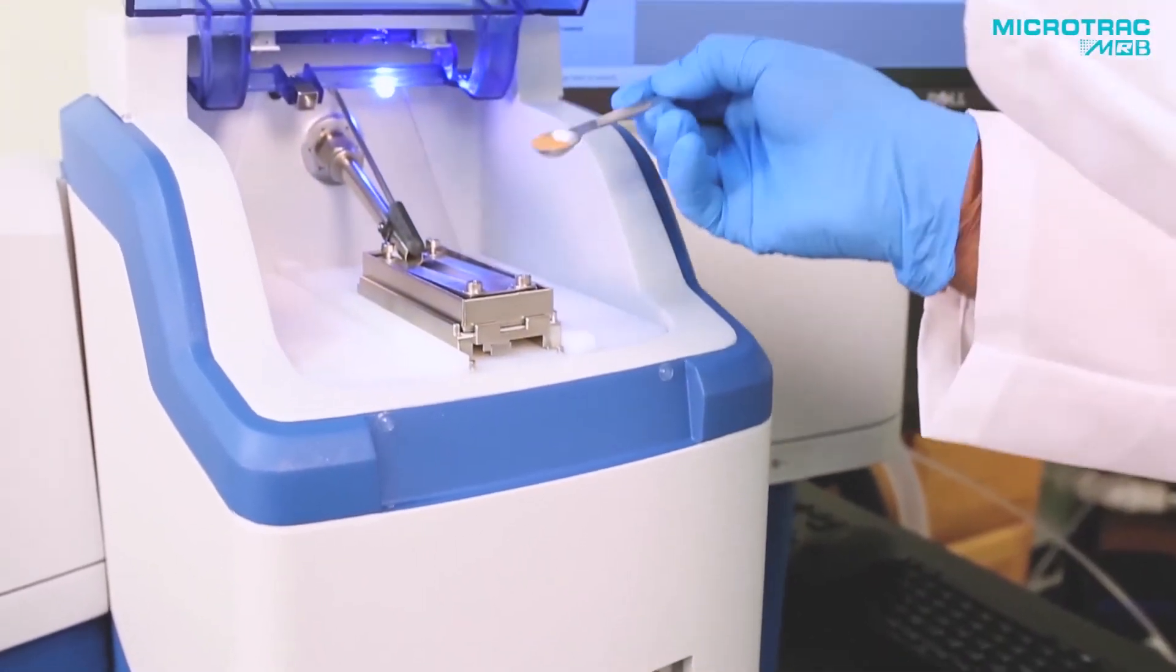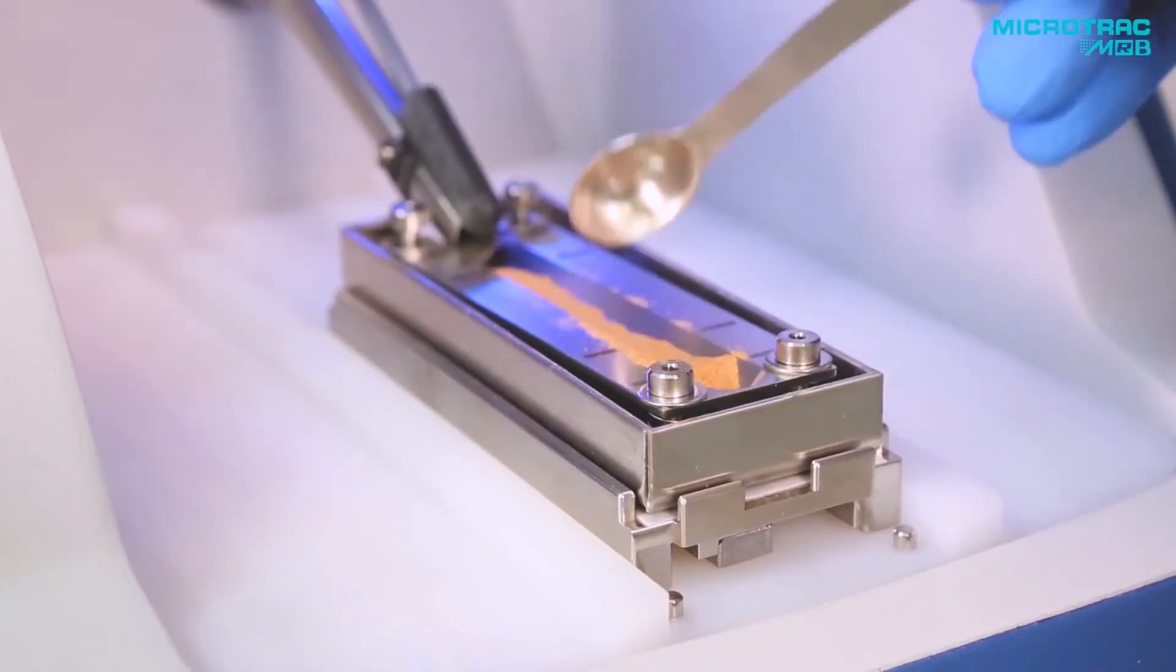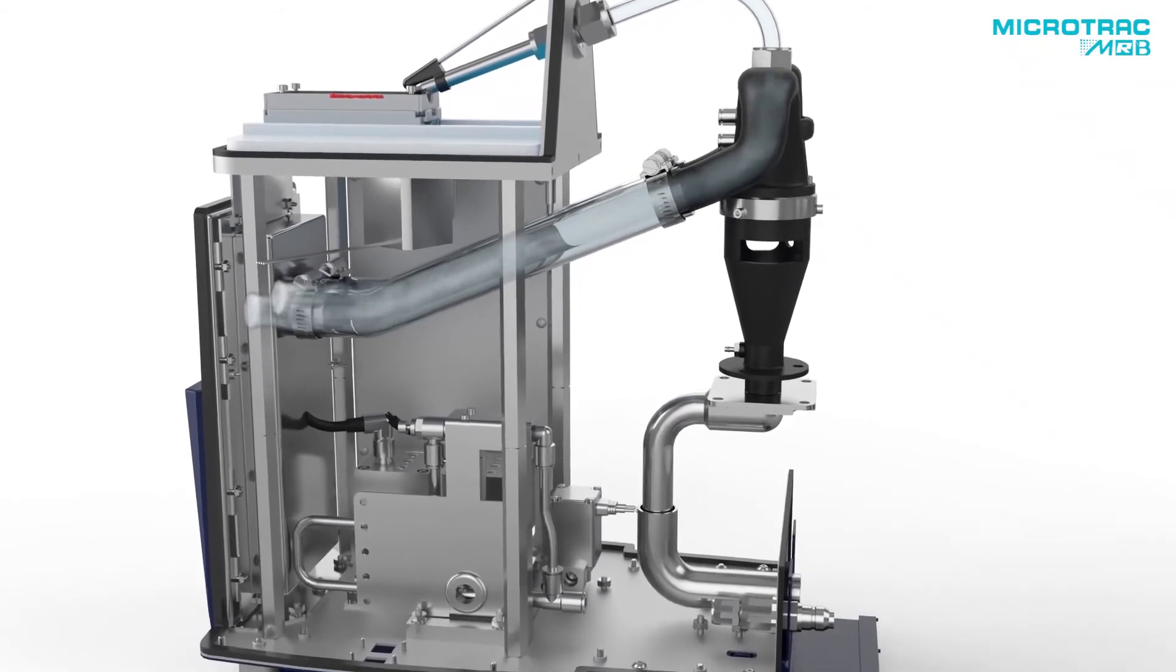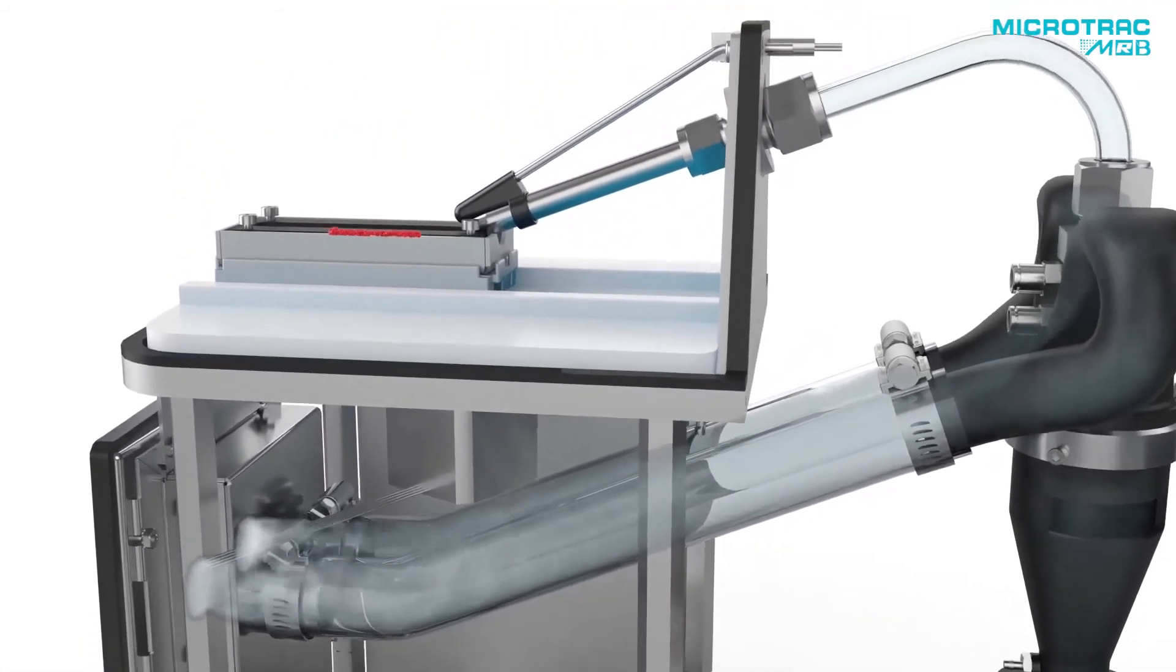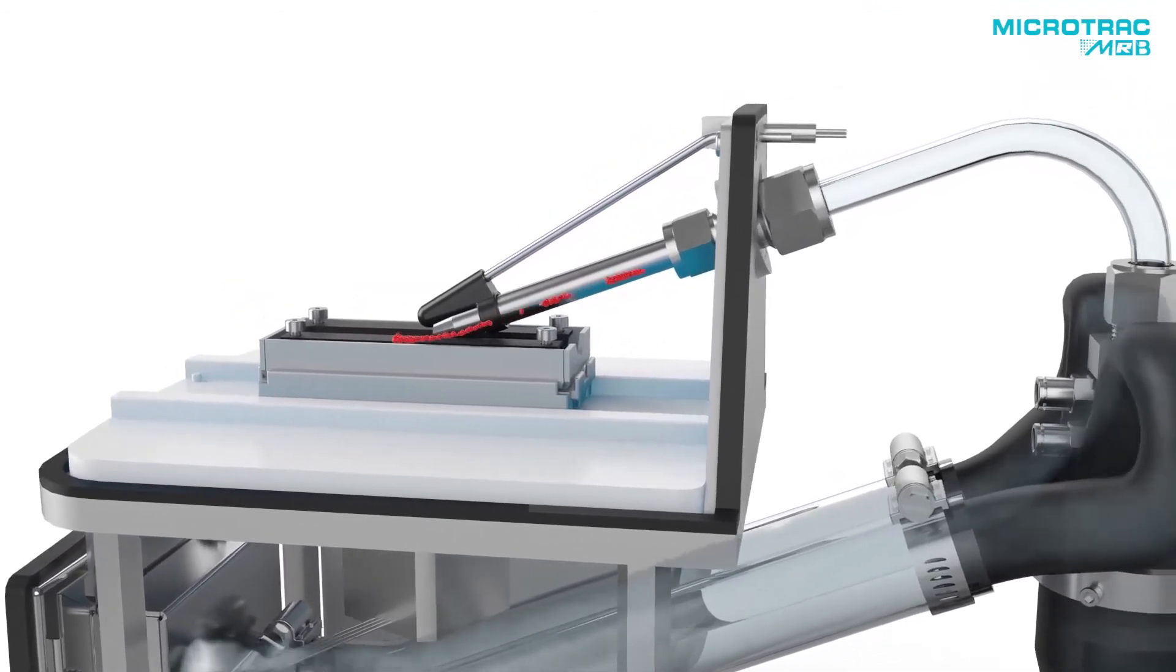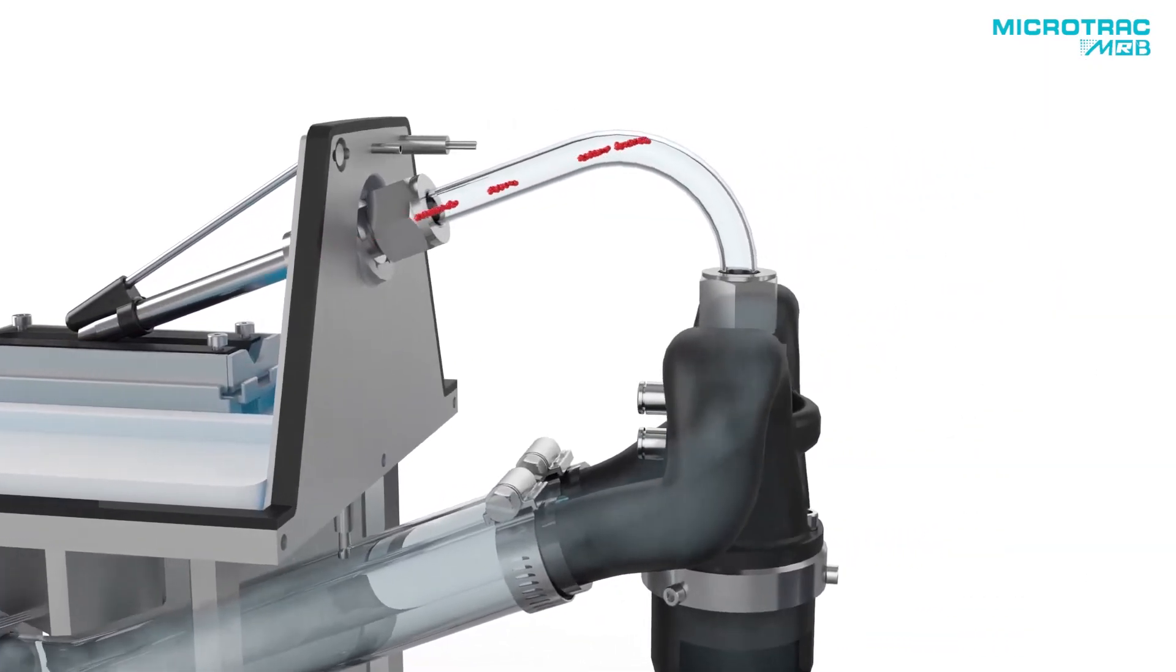Sample is placed on the tray and aspirated to the eductor. The eductor design directs compressed air through integrated turbo jets, ensuring that the material is fully dispersed before being introduced to the sample cell.